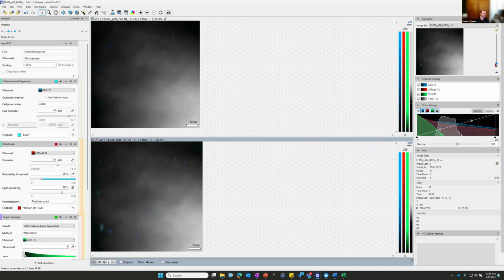So this is useful. I find it's useful if you're comparing 2 different types of data, like an experimental and a control condition, and you want to do some annotations or some segmentations, it helps to know what stands out. If you're testing maybe a certain drug on neurons and you have your control condition and experimental condition, and the neurons look completely different in the experimental condition, it helps having these 2 to compare.